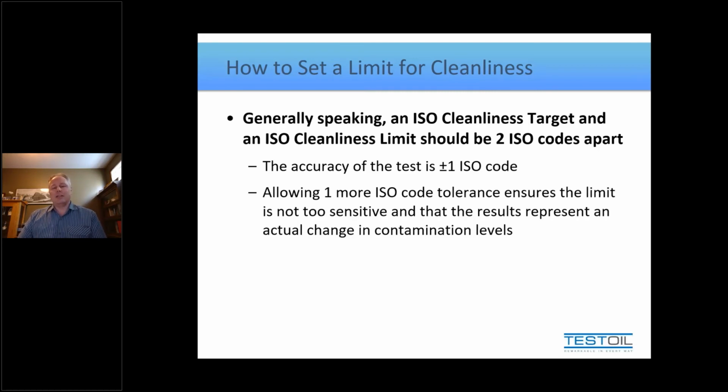You should give yourself an additional code so you're not always in reaction mode. Give yourself some wiggle room to allow the particle count to fluctuate from sample to sample before you have to take an immediate next step to try and remedy it.